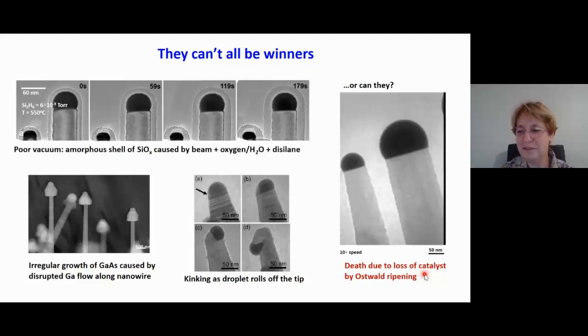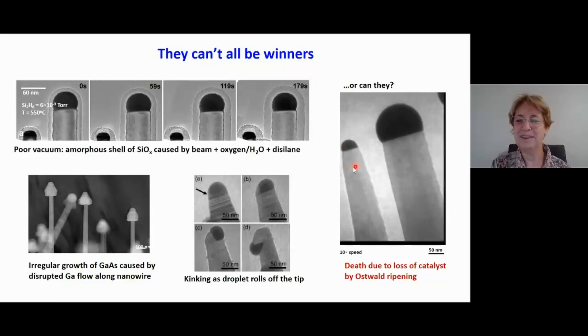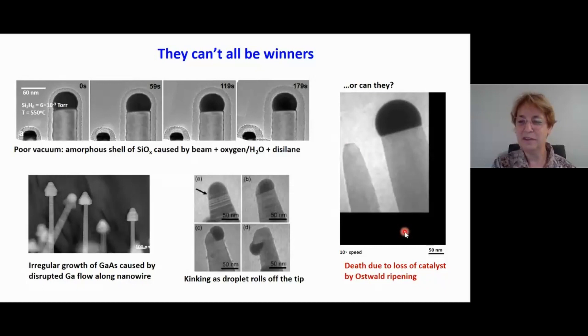I don't want to leave you with the impression that it always works and it's always happy. There's a lot of ways these experiments can fail. If the vacuum is dirty, you get contamination on the sample and nothing grows. If something goes wrong with the flow of materials, you can get these bizarre structures caused by lack of surface diffusion. You can get kinking of the nanowires if the droplet doesn't stay on the tip. Most fun of all is this process here. Two nanowires happily growing along near each other, but look what's happening. The gold from this one is actually disappearing. It's not evaporating, it's diffusing away over the surface. This is the process of Ostwald ripening where a small object is less stable than a nearby large one. The atoms, one at a time, diffuse away from here and on average will end up in here. This is a way that these nanowires fail, but it's also a really fun way to look at some of the basic physics of this surface diffusion process that is important in their growth.